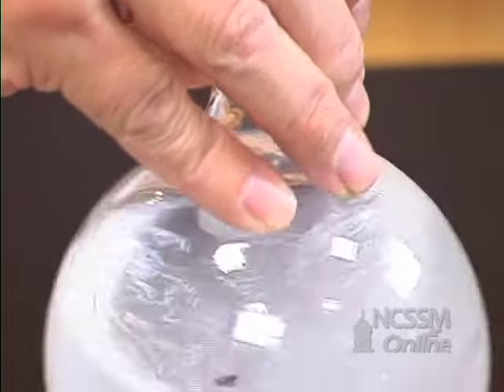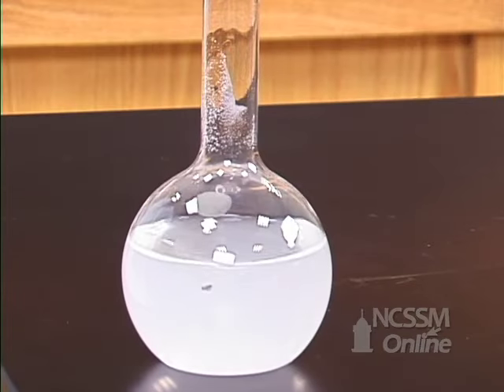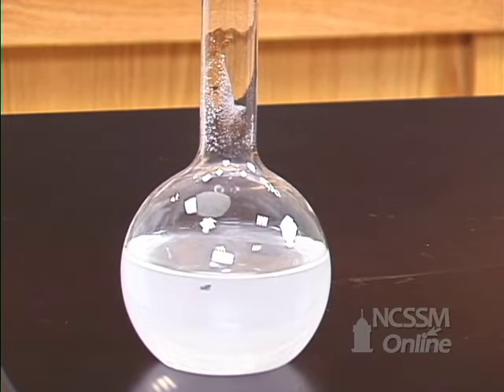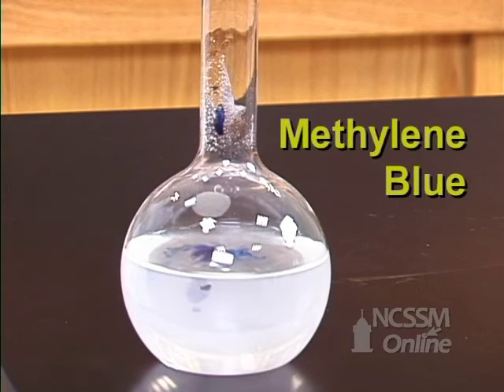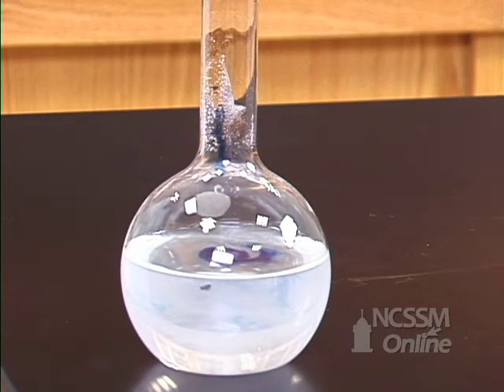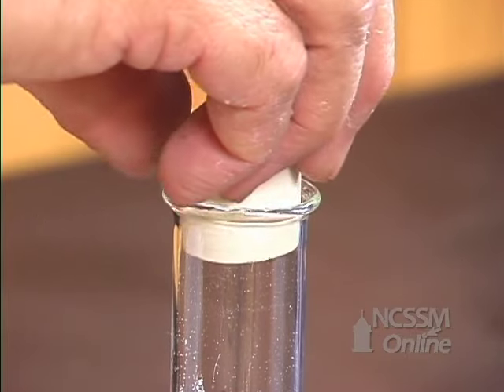I'm going to add a few drops of an indicator called methylene blue. Methylene blue is blue in the presence of oxygen and is colorless in the absence of oxygen.